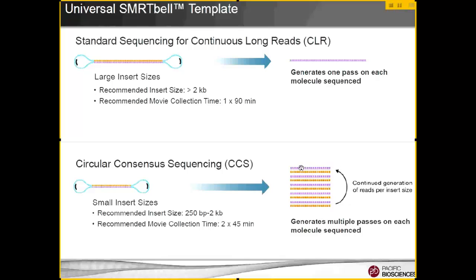And one of the things that little black box does is it will take all of these and then it will look at each position and decide if there are errors, and which of them is correct, basically by consensus. And then a little bit more sophisticated thing is if it sees that the lengths are not the same, it'll have to determine where in there it thinks that one of them had an insert where the others didn't.